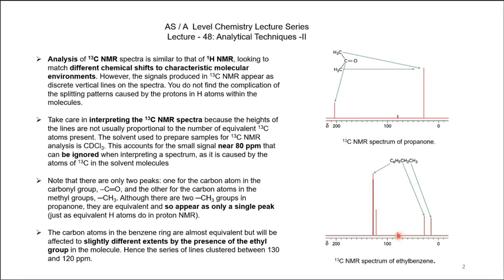Once I said that to make it easier, we ignore the peak of the solvent, so we'll ignore it. Then how many peaks do we have? What is it? Ethyl benzene. You see, this carbon has a different environment than this one, or this one has a different environment to this one. So we would have got 2 peaks for this ethyl group.